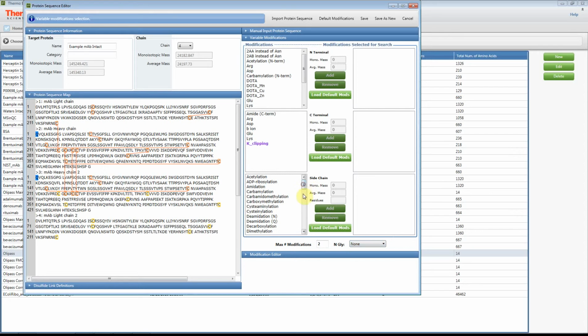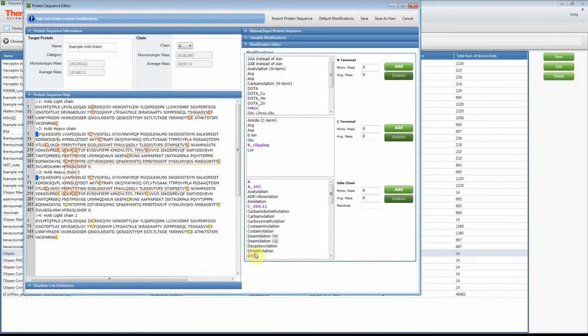The other option, if you're interested, is you could just add the masses of some standard glycans. In this case, I have a G0F and G0F combination, or you could add them individually. You'll notice that these are purple; the reason they're purple is that they're custom modifications. You could do that by going to the Modification Editor, and you can see that I have them, where are they?